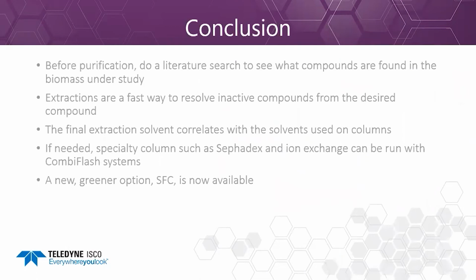So to conclude things, before purification, do a literature search to see what compounds are found in the biomass under study. Extractions are a fast way to resolve inactive compounds from the desired compound. The final extraction solvent correlates with the solvents used on columns, and so you can take advantage of that and purify your compounds more quickly. If needed, specialty columns such as Sephadex and ion exchange can be run with CombiFlash systems. And a new greener option, the AccuPrep SFC, is now available.